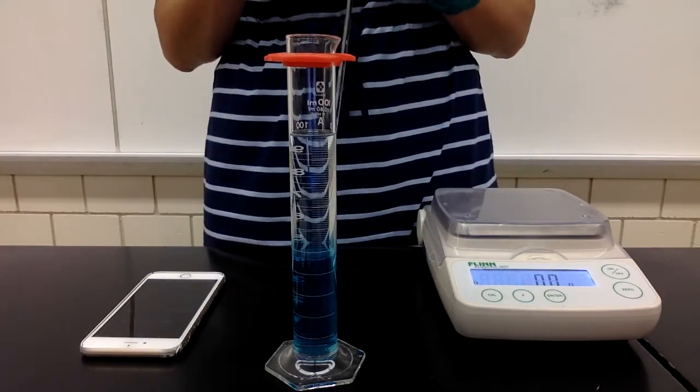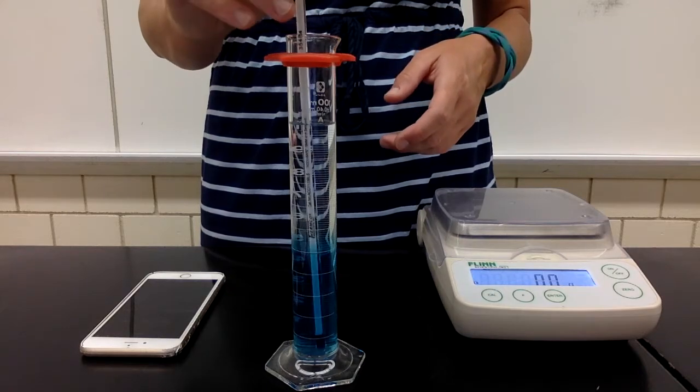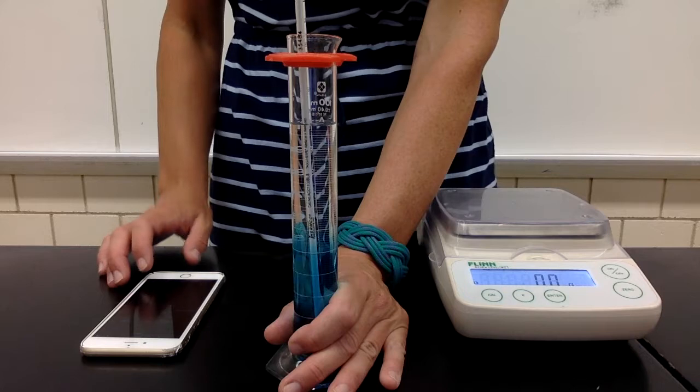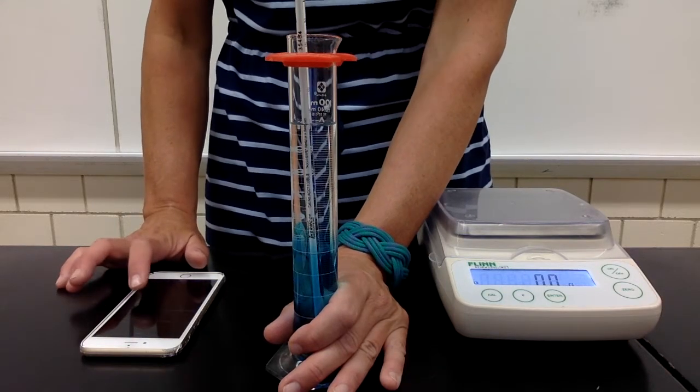Now I need to mix the ethanol and water for 2 minutes. I'm going to use my thermometer as a stirring rod. I'm going to hold the base of the graduated cylinder, start the timer for 2 minutes, and stir.